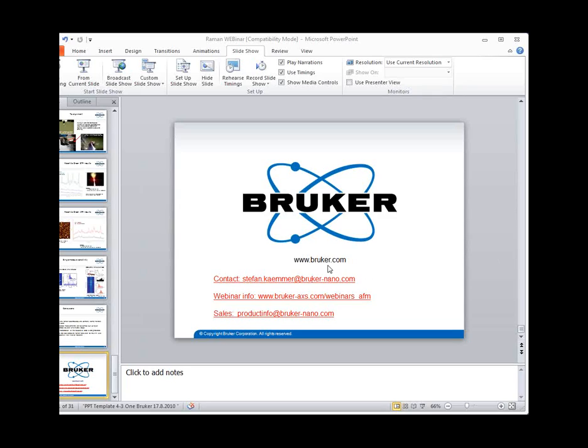Is it possible to obtain an AFM image and Raman mapping simultaneously? Yes, you should be able to do that. It depends on the instrument that you are using. For example, on the Innova TERS combination that I showed you, any instrument that is TERS enabled is automatically co-located. Because if you're not co-located, you can't do TERS, because your tip is not in the optical focus spot.